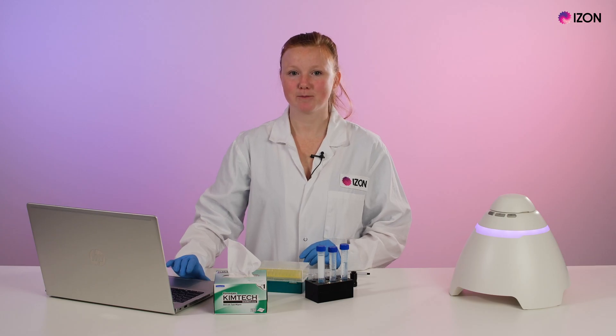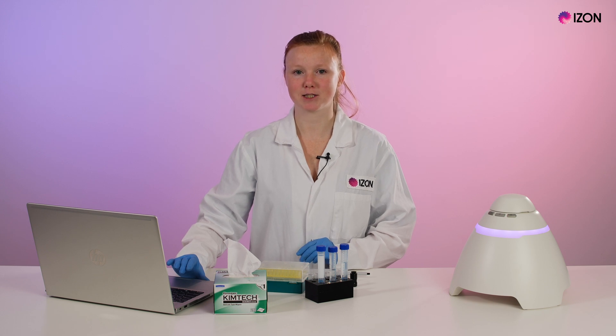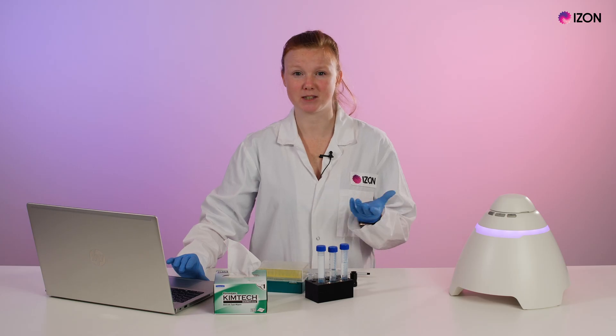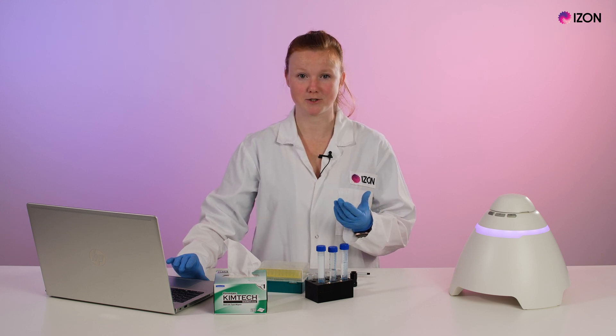If you are aiming to measure small particles, this will typically involve working at lower stretches and higher voltages. These higher voltages, however, may increase the RMS noise. To overcome this, you can increase the molarity of your electrolyte. For example, using double-strength PBS will allow you to work at lower voltages and overcome any potential noise issues.